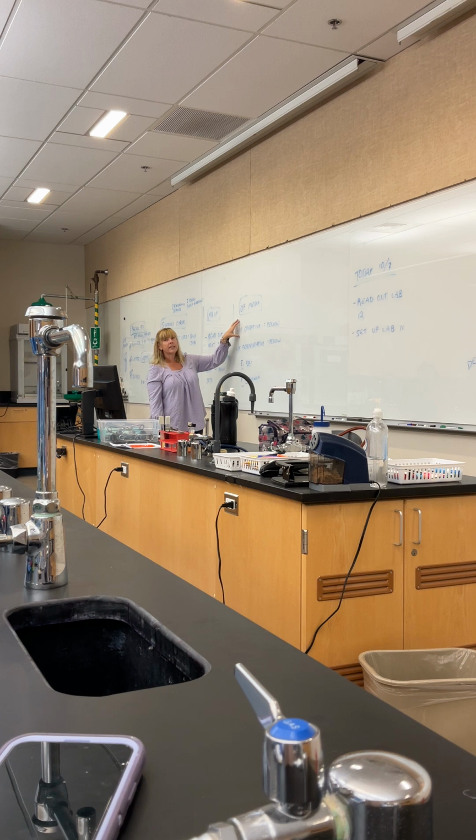Okay, last but not least, OF media. So our OF media, what color did it start? Started green. So if I'm oxidative, that means that I'm going to be able to turn a yellow color, and in this case I'm looking for a yellow color when oxygen's present.